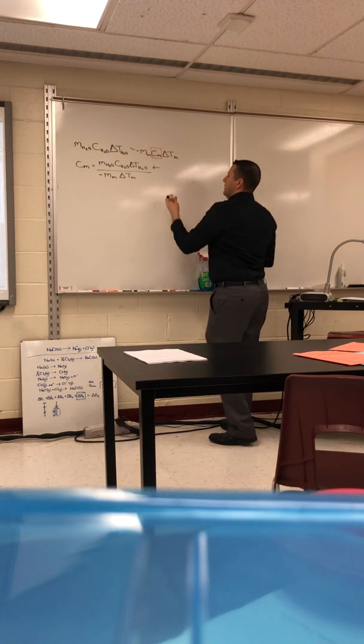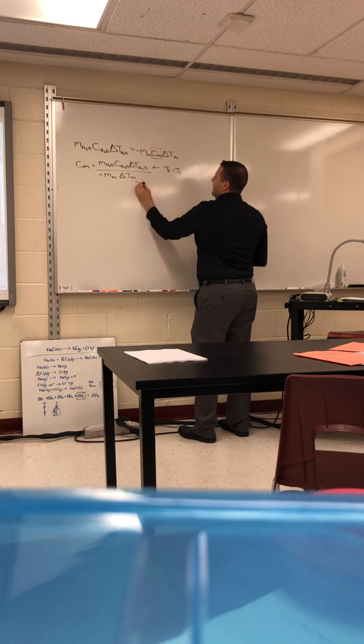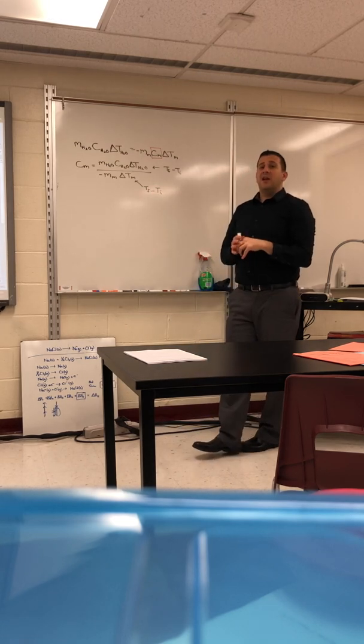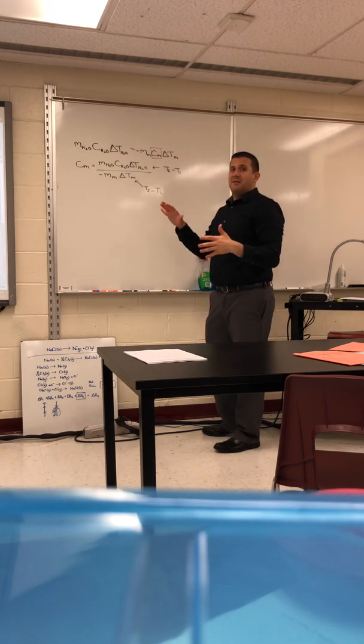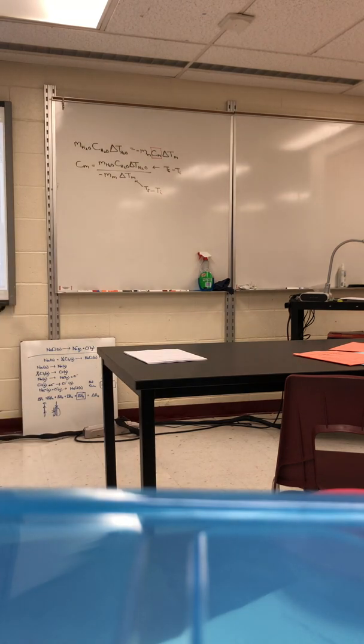Okay, so it's T final minus T initial down here, and the same thing for this one, T final minus T initial. The reason why this becomes so hard in Excel is you have to make sure you include enough parentheses to take care of everything.